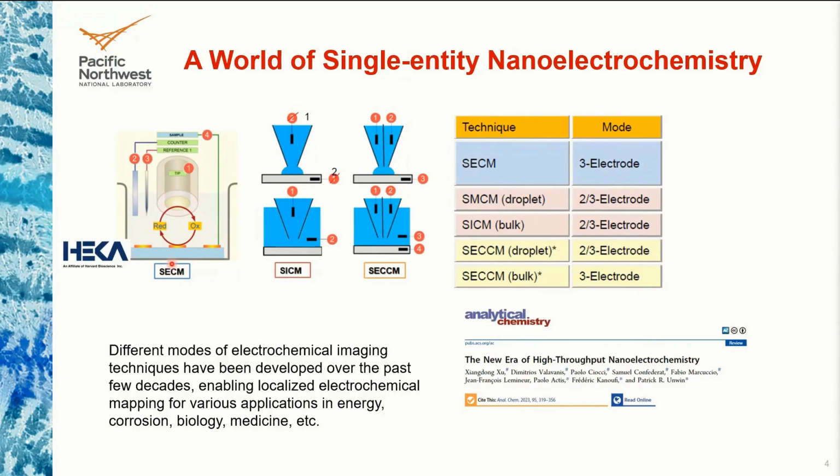There are various applications that stemmed from this SECM that still exist and are used in many groups and in many applications. But one of the key disadvantages, I wouldn't say disadvantage, but one of the key drawbacks is that we need to expose the entire surface again to it.